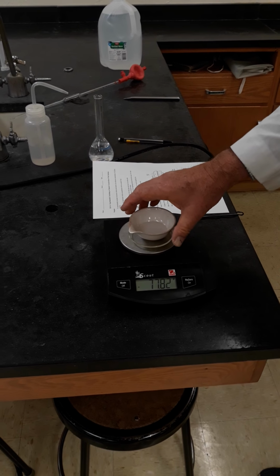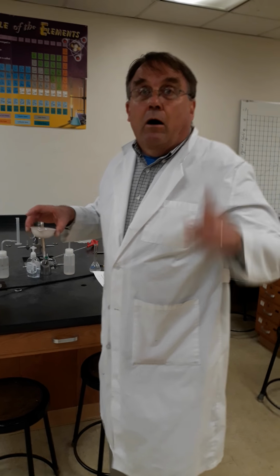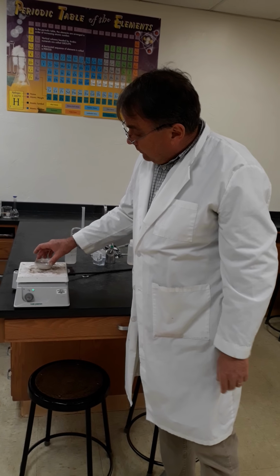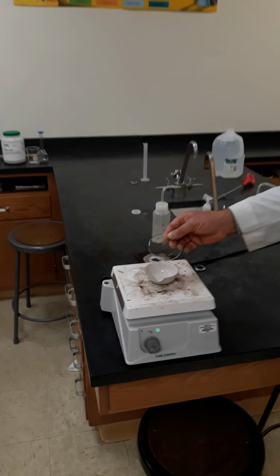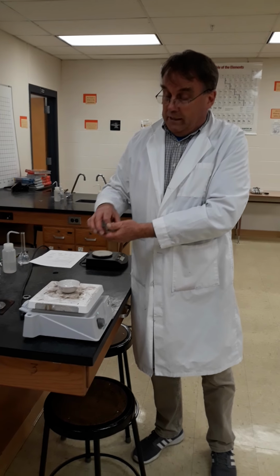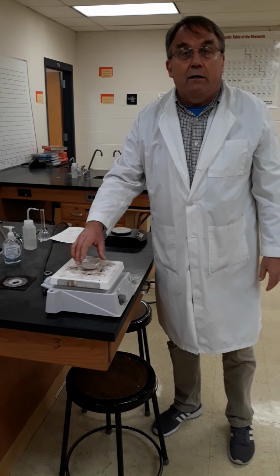At this point, if only there was an easy way to get rid of the liquid and leave the solid behind. Oh wait, that's where evaporation comes in. And that's where the lid comes in. Initially we don't want the lid so that the steam will just leave. But once it starts to splatter, we need the lid on, otherwise we will lose quite a bit of salt to splattering. So we will pause this and meet you back here in about 10 minutes.